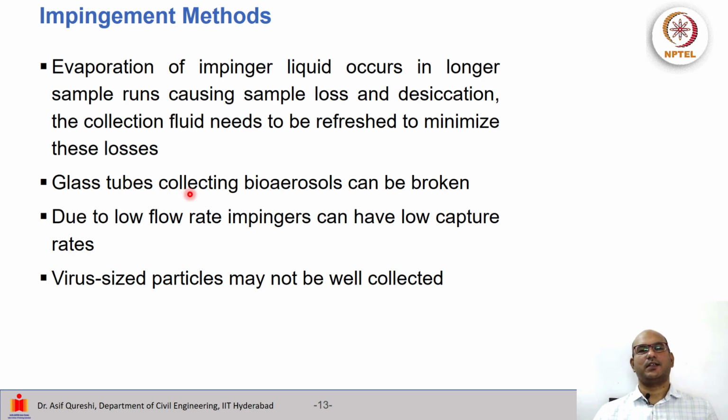Glass tubes that are used for collecting bioaerosols can also break due to handling errors, and due to the low flow rate, impingers can sometimes have low capture rates. It has been said that sometimes virus-sized particles may not be that well collected.